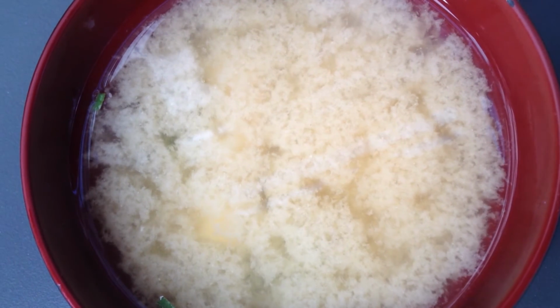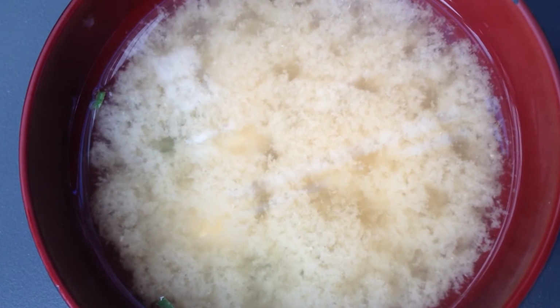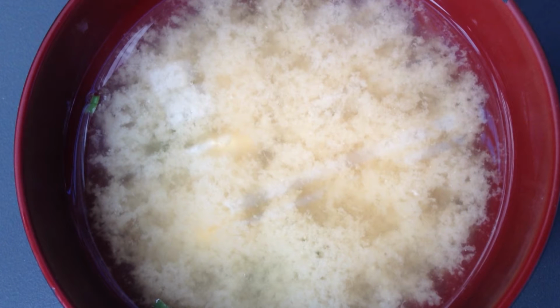But then what happens is, very quickly, everything stops moving and we get this coarse, sort of fluffy appearance. And what's happened here is that the particles have associated together. There's been a colloidal interaction. The particles have associated together, and they've generated, essentially, a really soft solid structure. And it's a structure that we could ultimately measure on the rheometer. And although it's an incredibly delicate structure, it's sufficiently strong to overcome the convection forces that we saw in the soup there, and also to overcome the inertia and the momentum that I'd put in from stirring the soup.